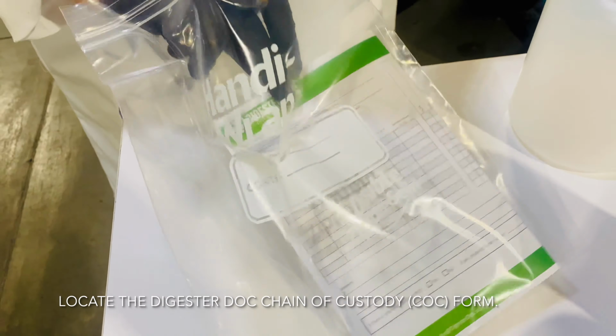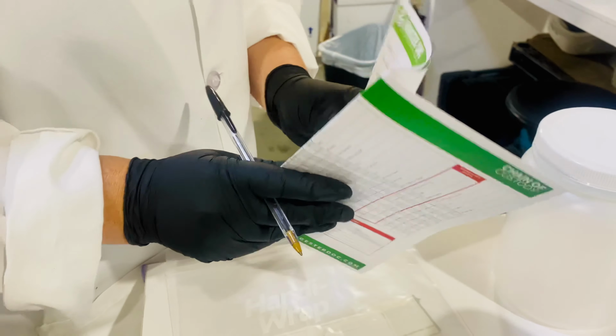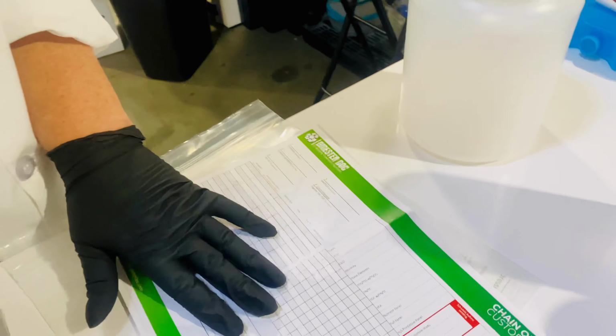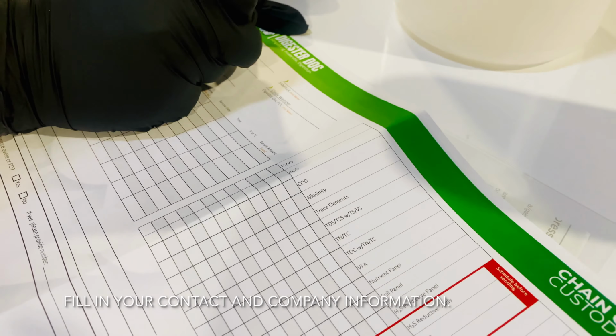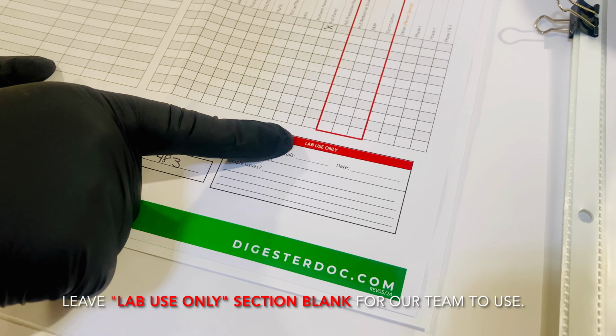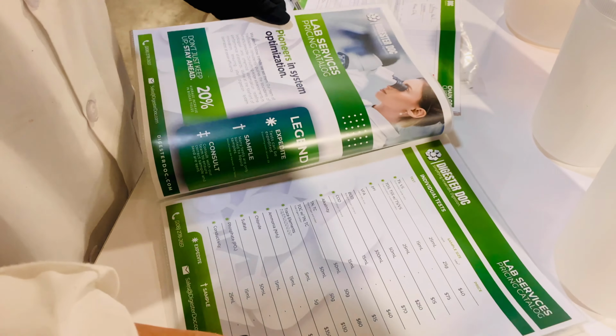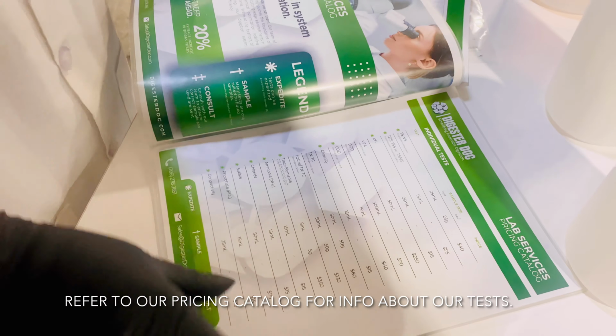First things first, refer to your chain of custody form. This document has all the shipping and packaging information you'll need. It's crucial that you fill out all the required sections accurately. And remember, leave the lab use only section blank, as that's for us here at Digester Doc. Remember to refer to our pricing guide to find out further information about our tests.